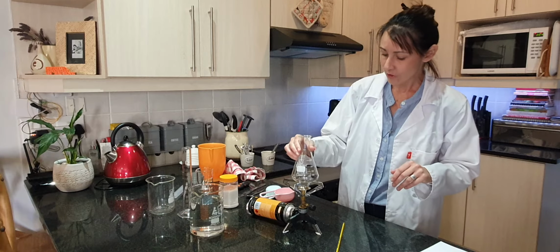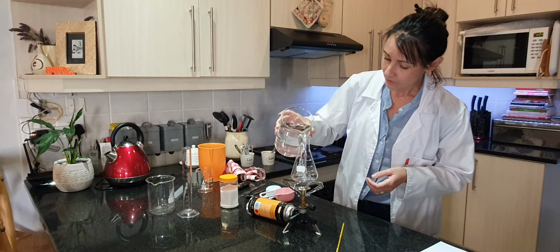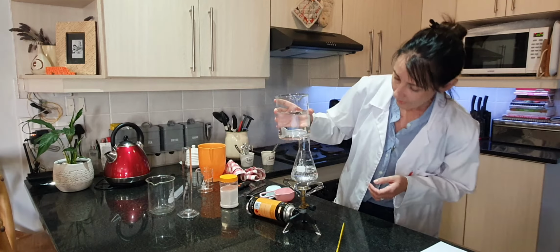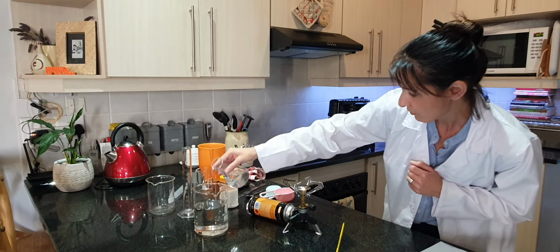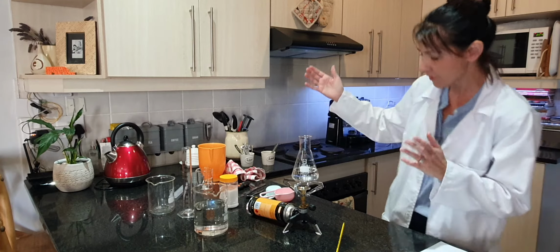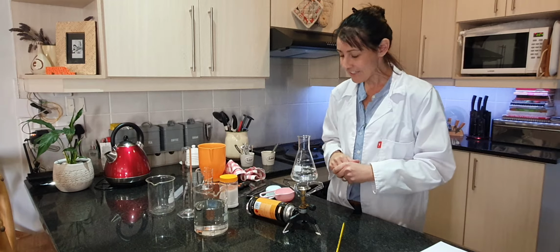So I don't want anything to influence my experiment. So I'm going to use my conical flask, and for the next round I'm going to put 150 mils of water into it. I'm just going to do a little bit out, let's see, so you can get it as accurate as possible. There we are. 150 milliliters.